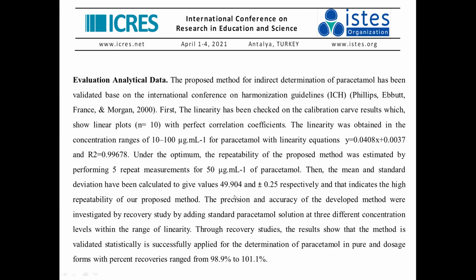All this indicates that our experiment is very accurate and has high precision. That means we can repeat the experiment and get almost similar results. Therefore, we can depend on our method to determine the concentration of paracetamol in different formulas.